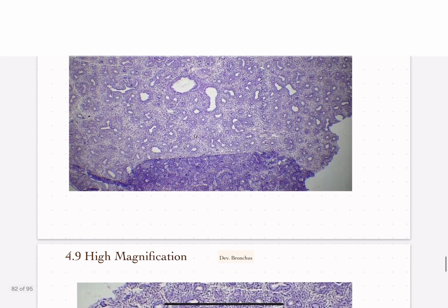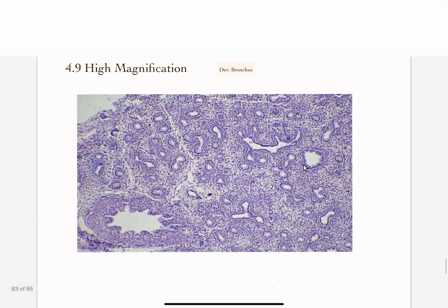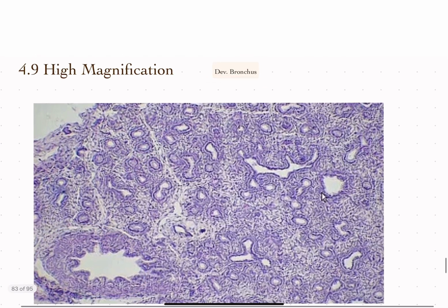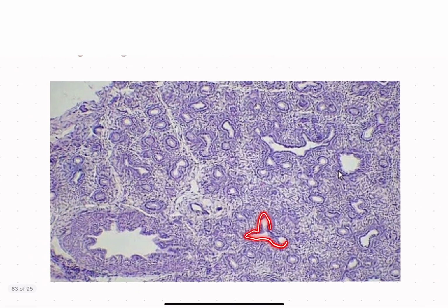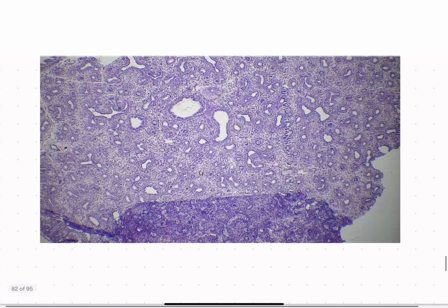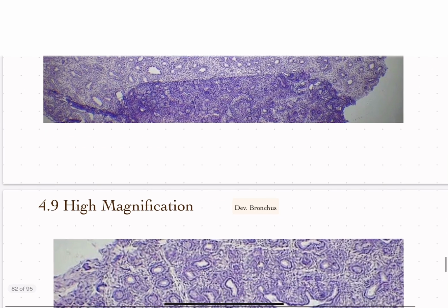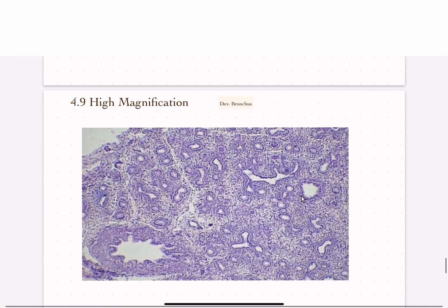Next up, developing lung in pseudoglandular stage. And like I said here, we can zoom in. We can kind of see the developing pleura, not really. These are bronchioles, these small ones. These larger ones are known as the developing bronchus. These are the dichotomous division because they look like a fidget spinner. Trying to find another example of one here as well. This one. And maybe this thing as well. They make it a lot more clear for you in the colloquium.